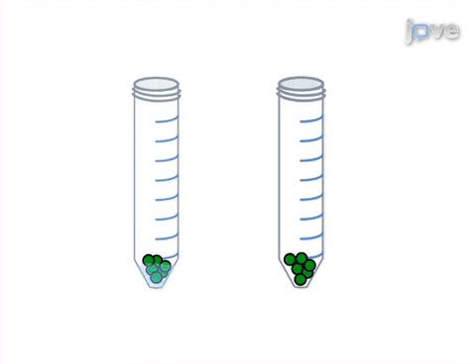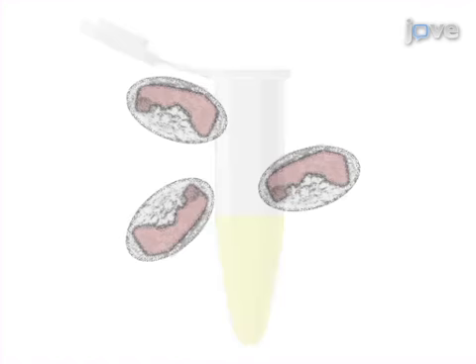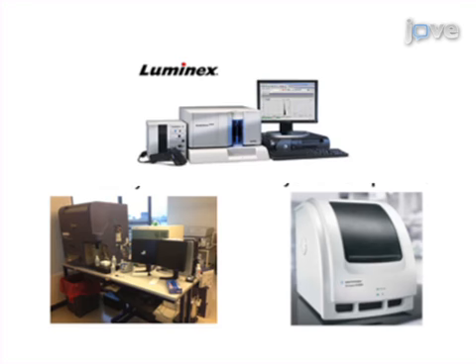Incubate the cells with either the isotype control or the blocking antibody of interest. Then stimulate the cells with the antigen of interest. Next, centrifuge the cell cultures in order to collect supernatants for cytokine measurements and cell pellets for phenotypic analysis or transcriptional analysis. If desired, adapt this protocol to include sorting the individual cell types by flow cytometry.